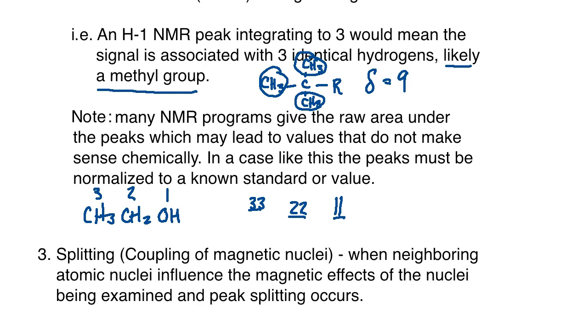All right, so there's a couple of techniques you can use here. You can take the lowest value and divide by it and then move forward from there. So you assume that the lowest value is always going to be associated with 1 hydrogen in that case, right? So if I divide by 11, I'd get 1, 2, and 3 back. This is a technique many teachers will tell students to use on raw data like that.